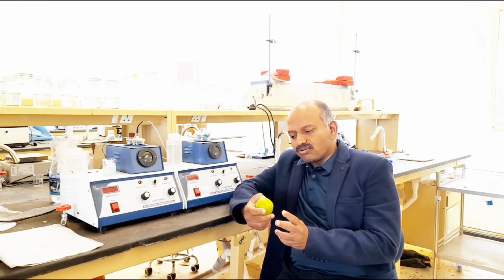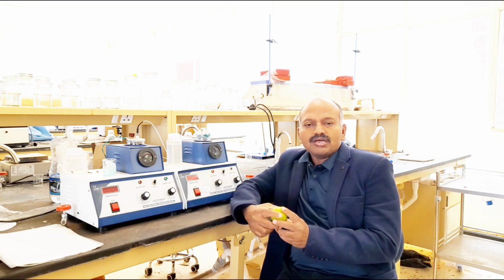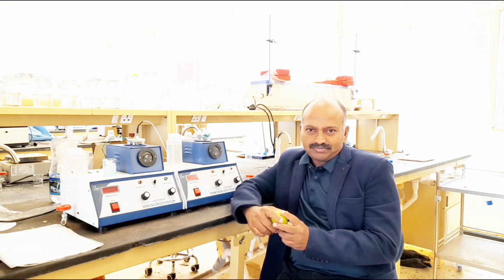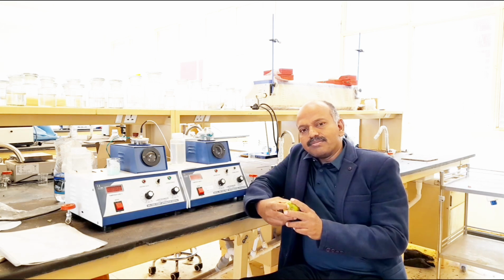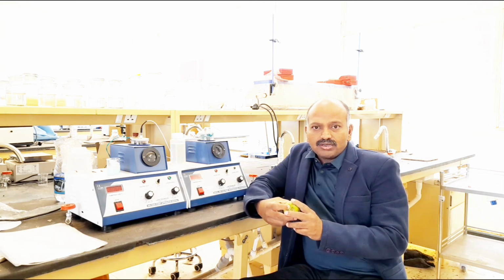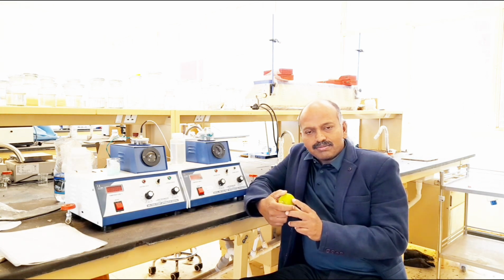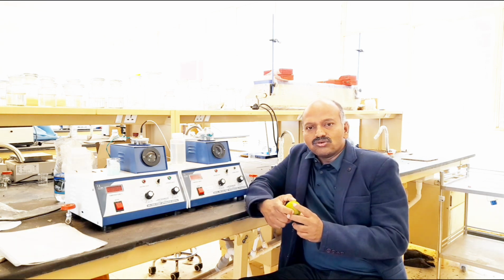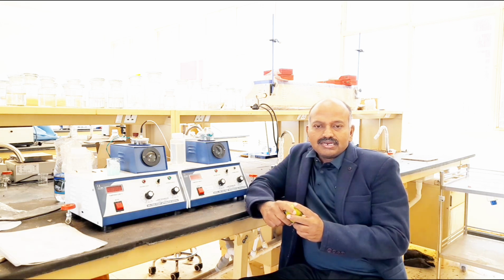From that, we have to take all the juice into a 100 ml volumetric flask and make up to the mark with distilled water. Then we take 10 ml from that volumetric flask into the conical flask, and add 10 ml of distilled water. Then we need to add the indicator called phenolphthalein. Phenolphthalein gives no color in the acidic medium. So when you add 2 drops of phenolphthalein indicator, it appears colorless.